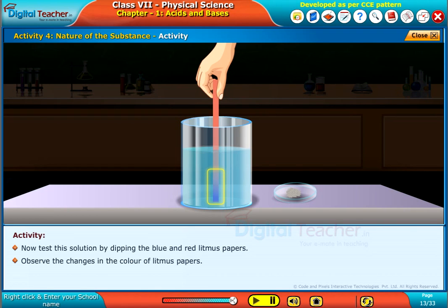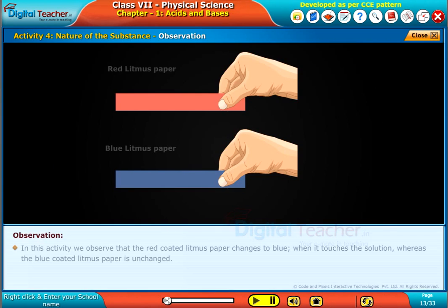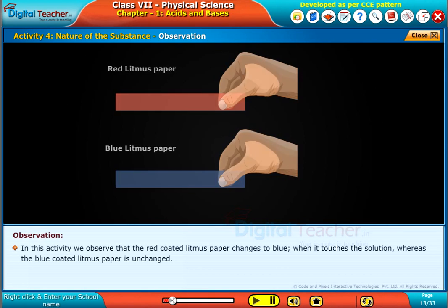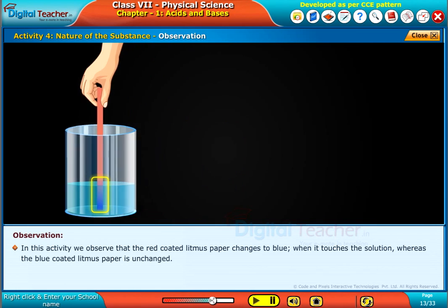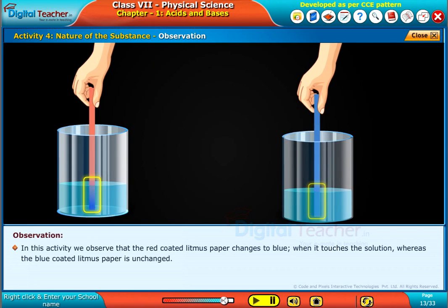Observe the changes in the color of the litmus papers. In this activity, we observe that the red litmus paper changes to blue when it touches the solution, whereas the blue litmus paper remains unchanged.